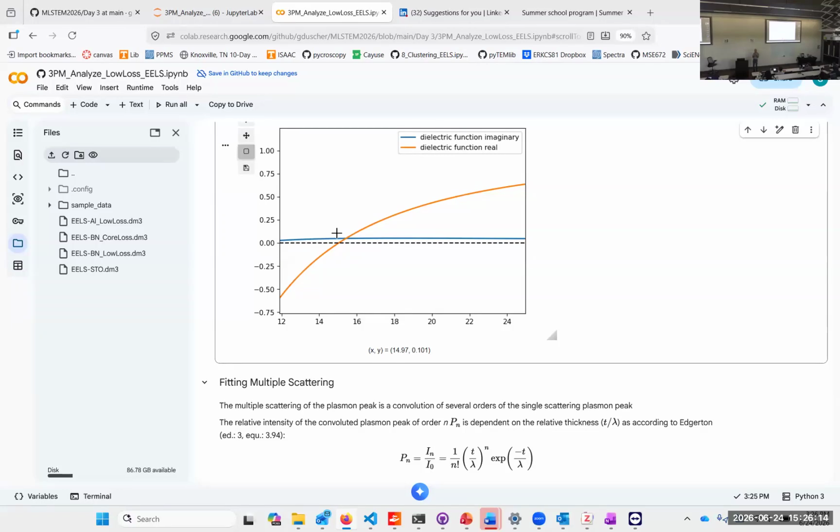I didn't explain what a plasmon is, right? Do you know what a plasmon is? Okay, why didn't you pipe up? Okay. Let's explain what a plasmon is. I missed that. I normally do that. Does anybody have a cup? Ceramic one? It's a bottle. Okay. I might grab Aiden's here, but for a second.